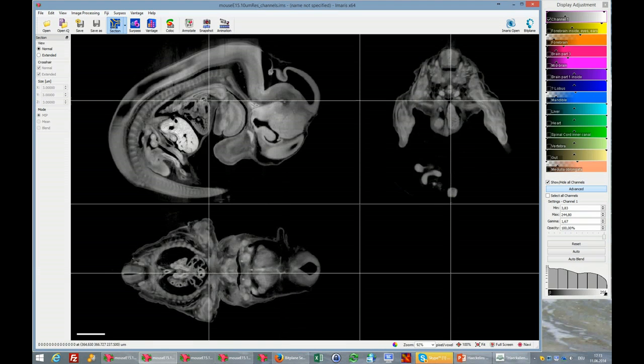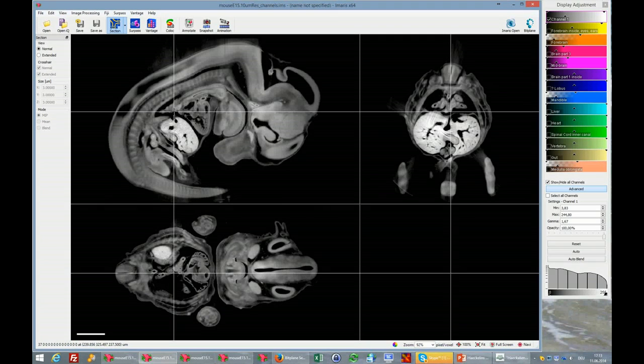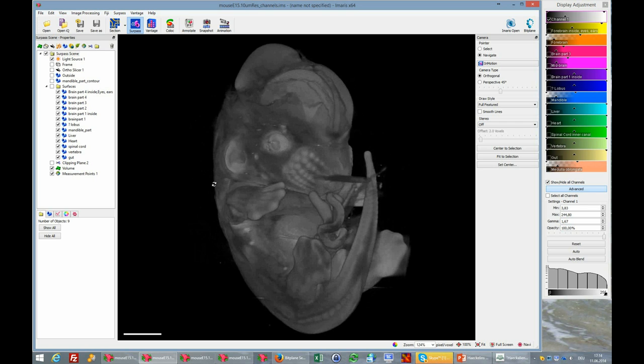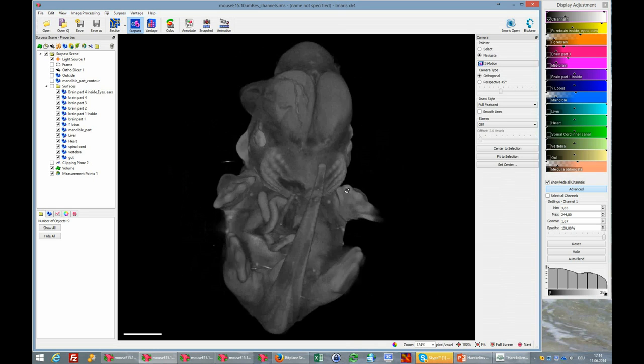So from here, of course, we want to go further into real 3D because this is what Imaris is built for. And so we move to the next visualization tool, which is called Surpass. And inside Surpass, you get now already a 3D reconstruction by default. So if you open this, all the layers which we have seen before are brought together, and you get a 3D reconstruction. What I do now here is always live. It's not pre-recorded. So here you can rotate this, for instance, and look from different angles.